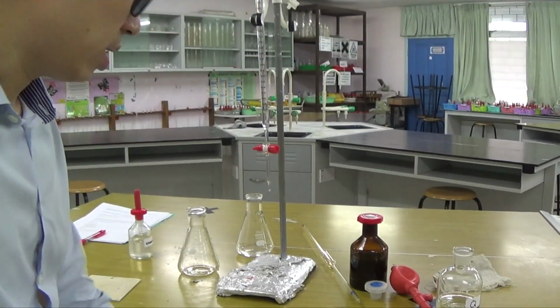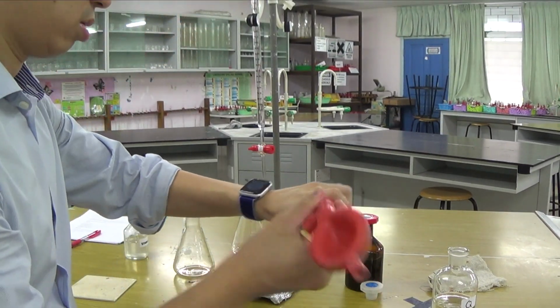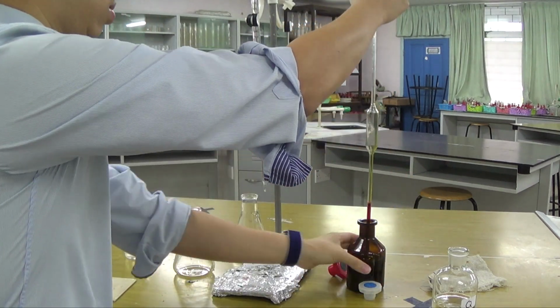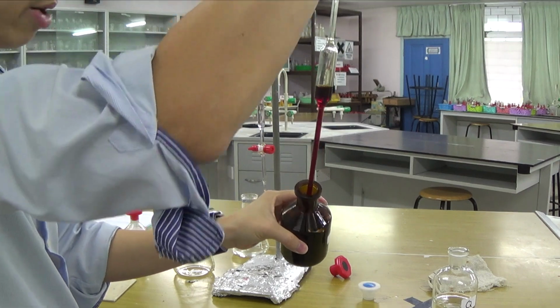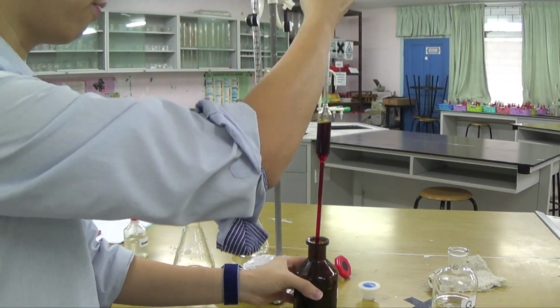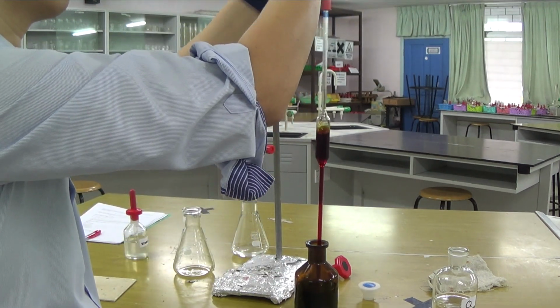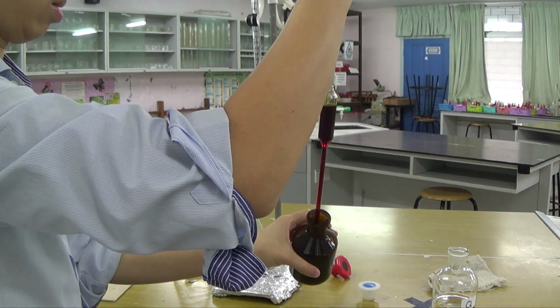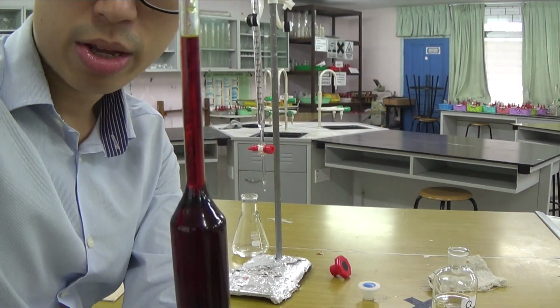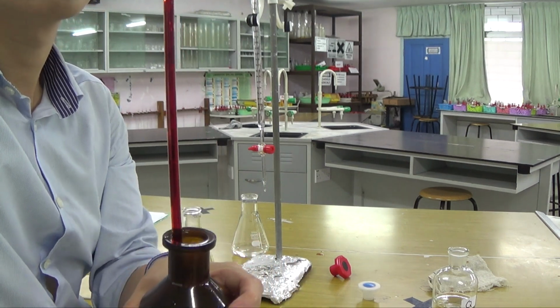So what happened now is, let's just pipette out what we need. Oops. So doing our second exact titre, which is essential. I think I've got a bit of air inside actually. So you don't want air bubbles inside your pipette reading. So let me just get this right and then I'll show you where I am.